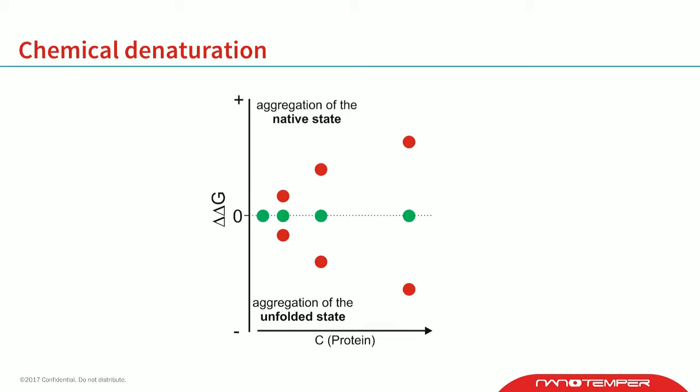All right. The next example, again, is very different. Now we look at chemical stability, and not just simply looking at a delta G measurement. I think you're all familiar with those. They're really useful, really established, but we can go a little bit meta on this and zoom out a little and use delta G measurements at different concentrations of protein to predict aggregation propensity.